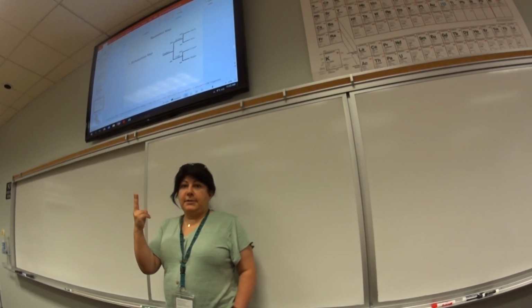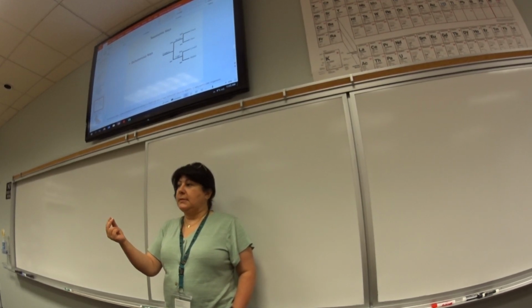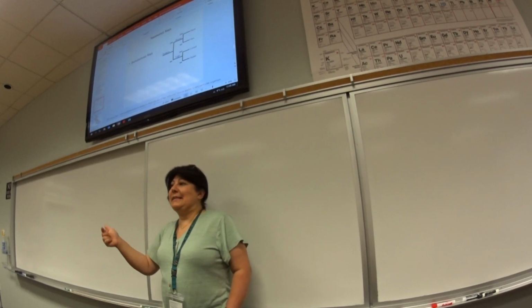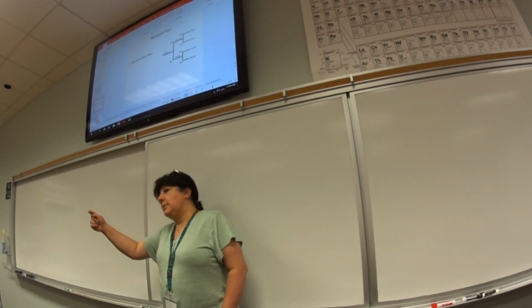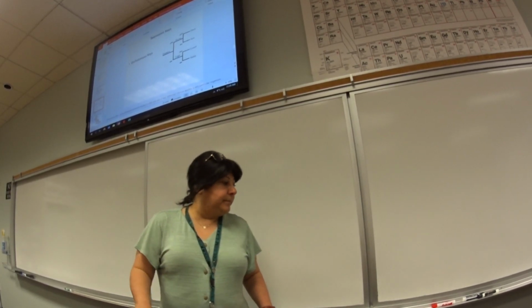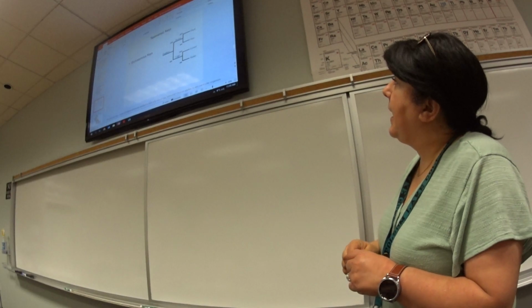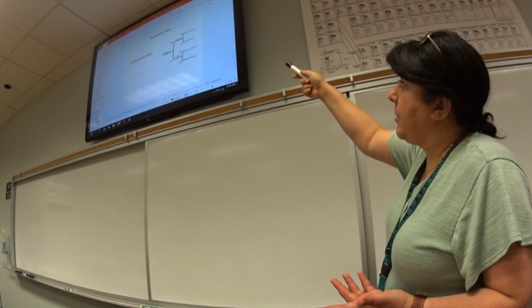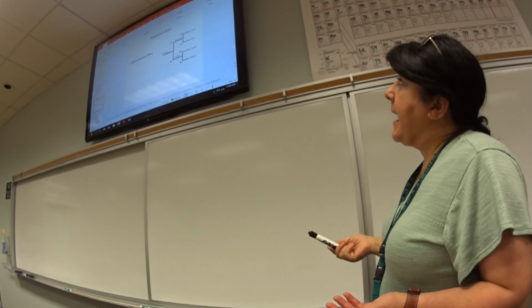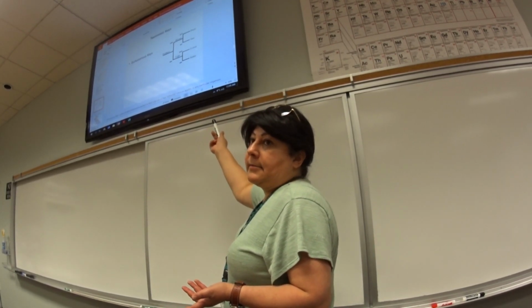Dichotomous means two-part. So you can actually identify a species based on answering these two-part questions. And the two-part questions are: is it this? No, go here. Is it this? Yes, go there. So a question has two parts. Let me give you an example. I want you guys to create a dichotomous scheme. For example, I have up there, feathers: yes, you go to that other question, no, you go to the other one. If they have feathers, does it swim? Yes, it's a duck. No, it doesn't, it's a hen. All right?